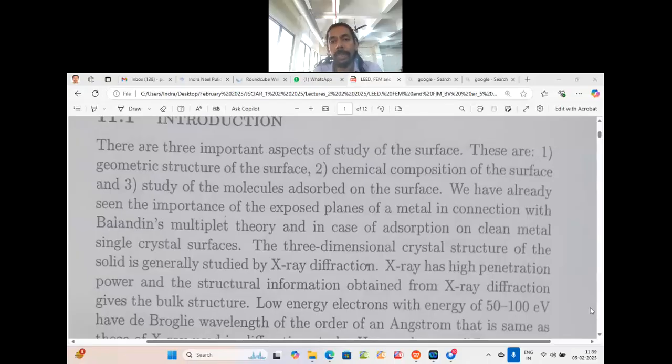And from the 2 theta, from the peak position, we calculate the d using the Bragg equation. n lambda is equal to 2d sine theta, and lambda is the wavelength of the X-rays that are used on the surface of the bulk material, the solid catalyst.